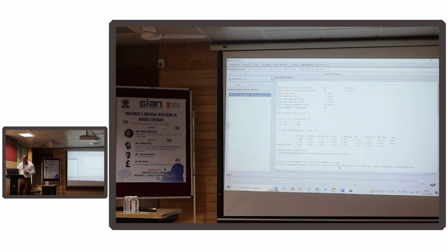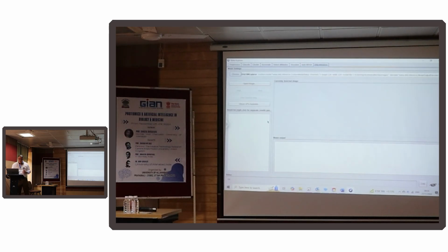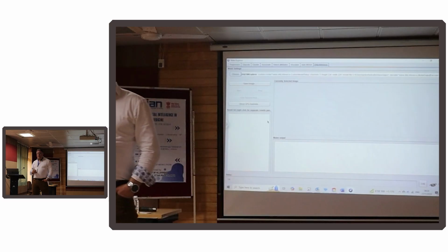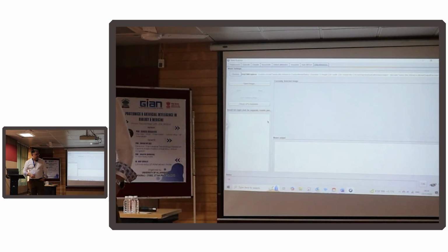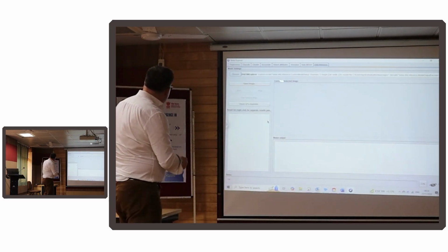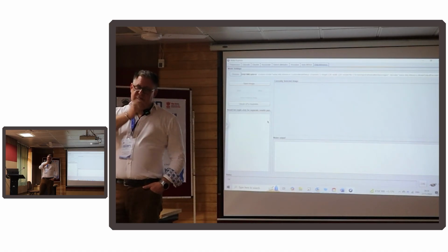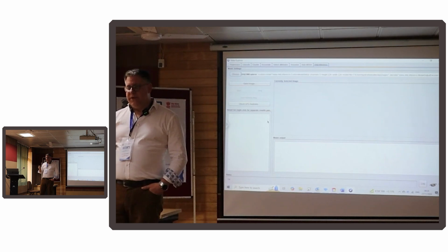Okay. The other thing I can do, I just want to show this. This is specifically for image analysis using deep learning. What I can do here is label images with a class name in a folder.